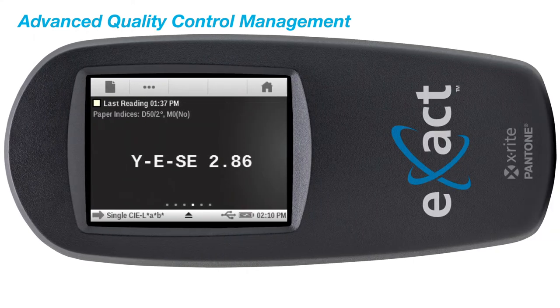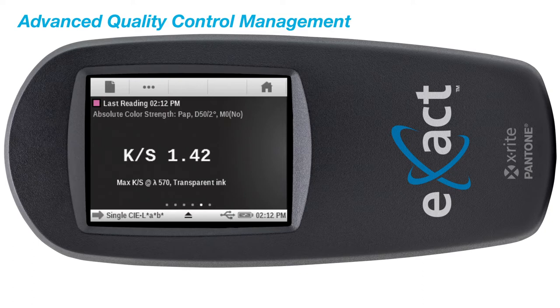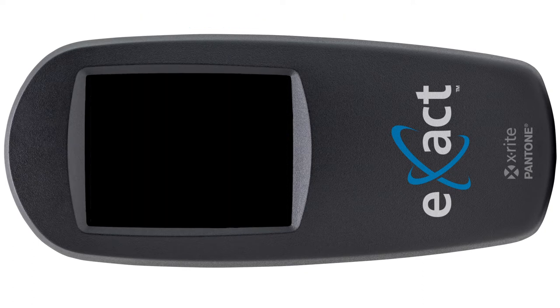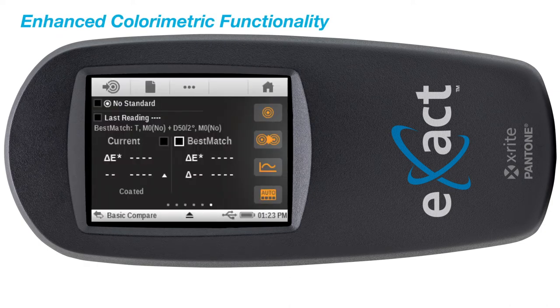Features such as paper indices, metamorism, color strength, opacity, and delta-e trends. It also includes the best match function, which will provide guidance for you to achieve the best color match quickly and efficiently.